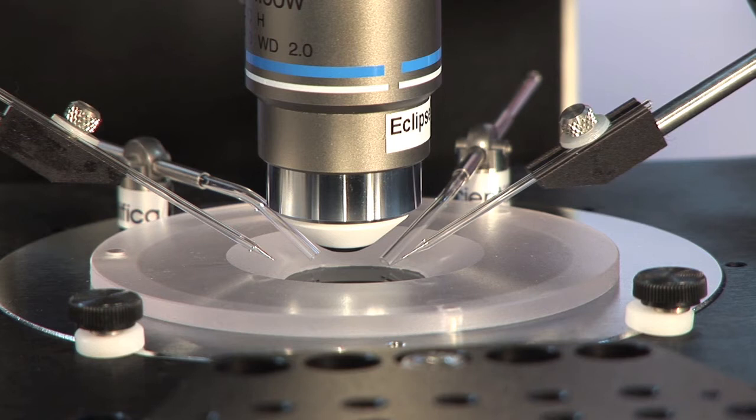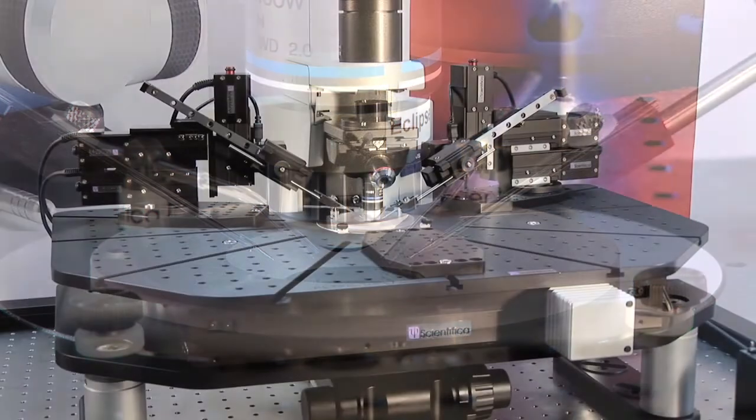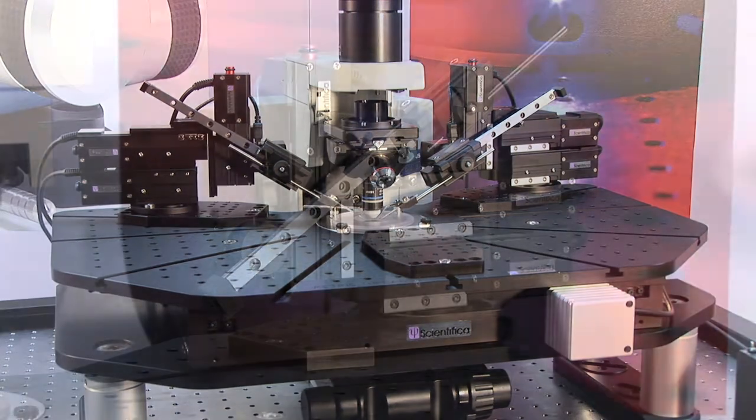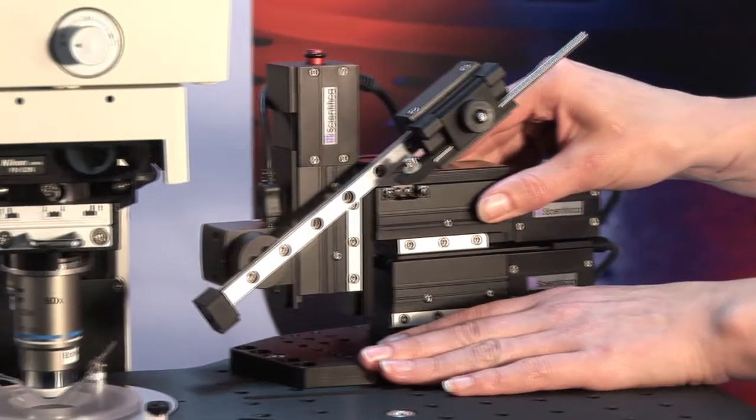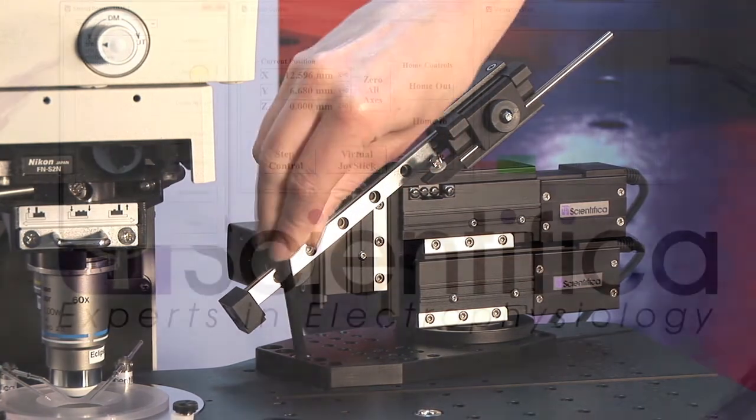There is often the need to fit a range of equipment or multiple manipulators around your preparation. The large surface area of the top plate and flexible T-groove carriage system allows optimum positioning and maximum versatility.